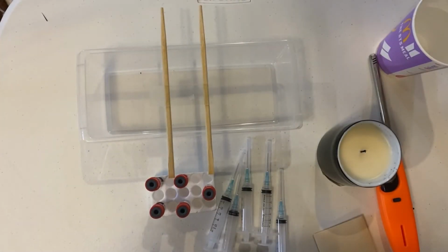Good day, everyone. Today, we will talk about gram staining. Gram staining is used to determine if a microorganism is gram positive or gram negative. So without further ado, let us start.